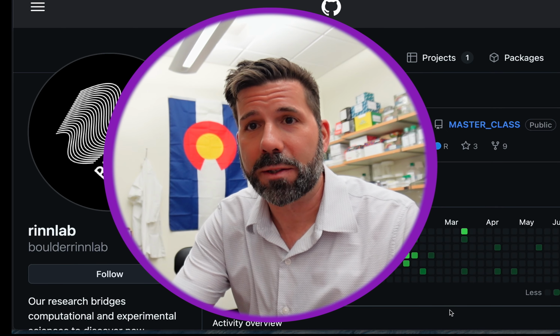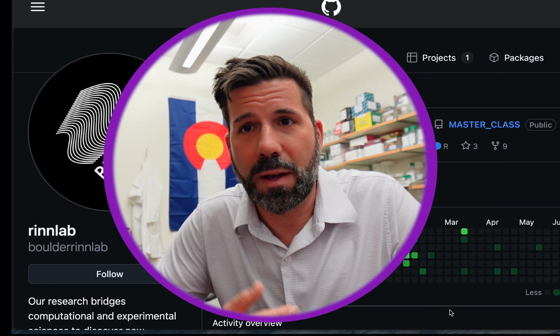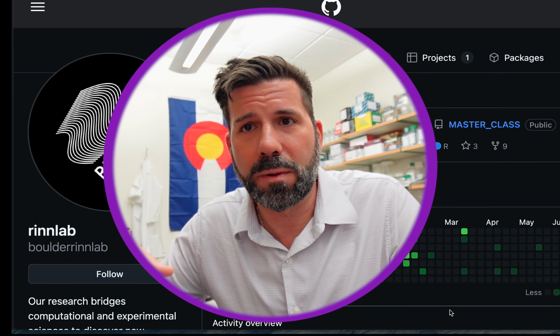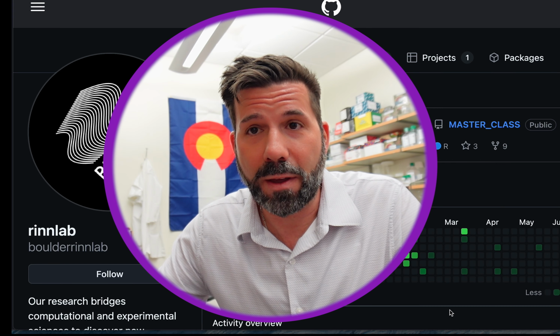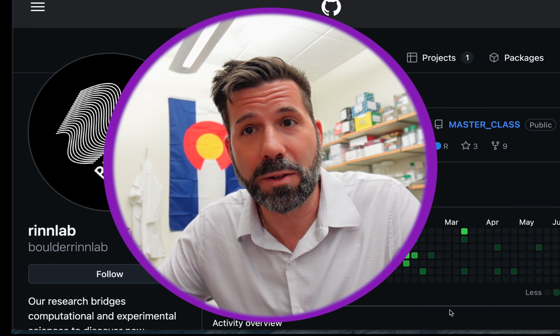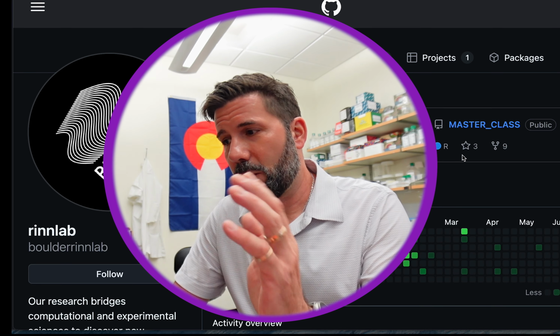We are on level 6, we've leveled up, and we are going to start to run DESeq analyses, find genes we would think are statistically significant, and then eventually in level 7 make figures of them. And that will complete our RNA-seq adventure, and we'll find lots of results along the way. So let's get started.